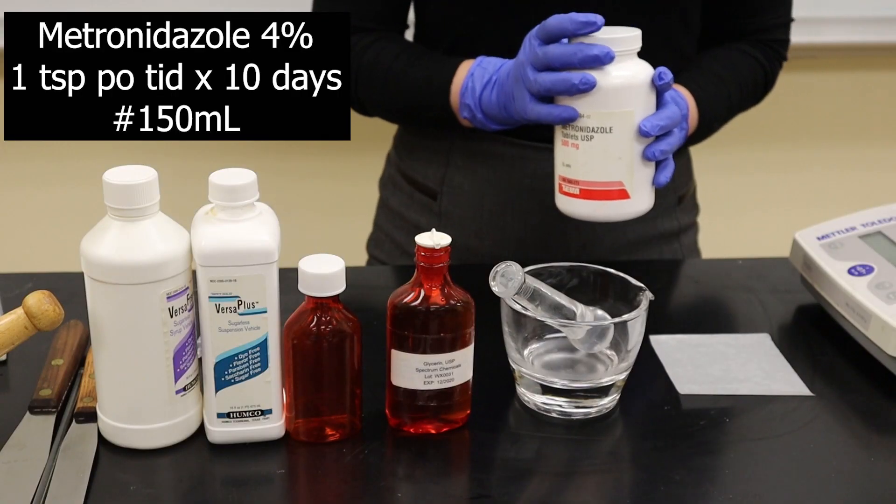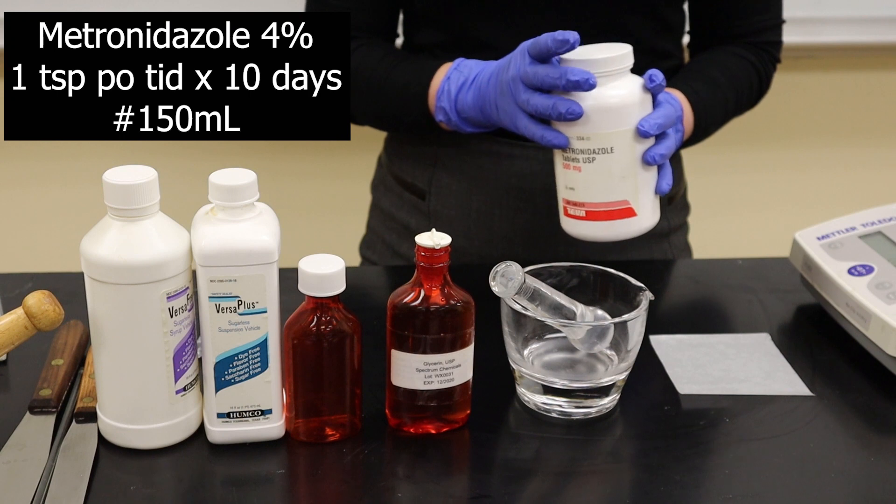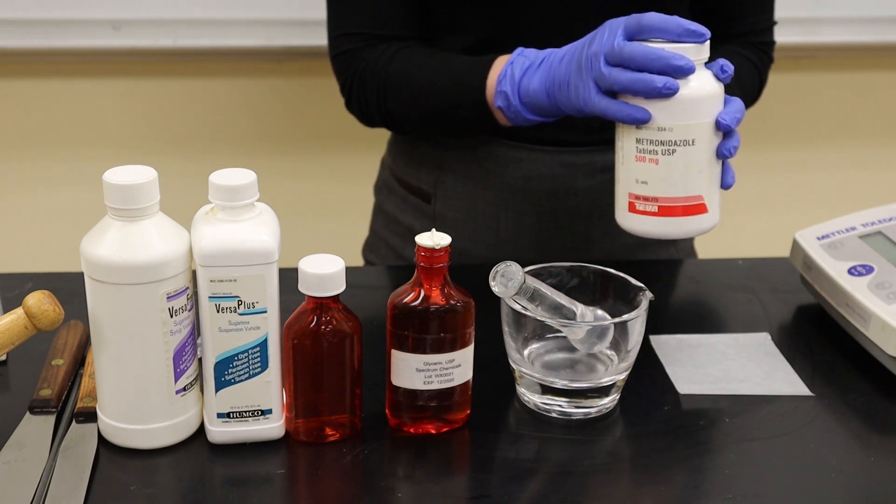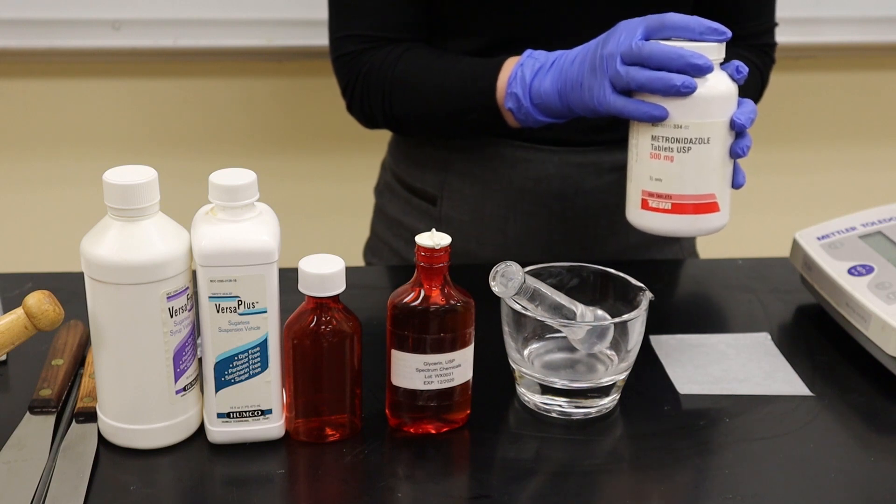We're going to make a metronidazole 4% oral suspension and we need 150 ml of that. If you watched the previous video you'll see all of the calculations that are needed in order to compound this product.